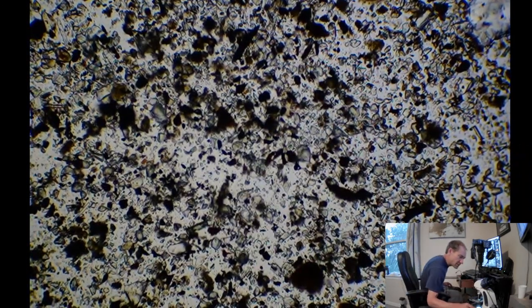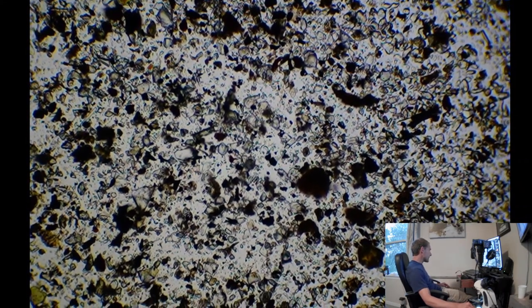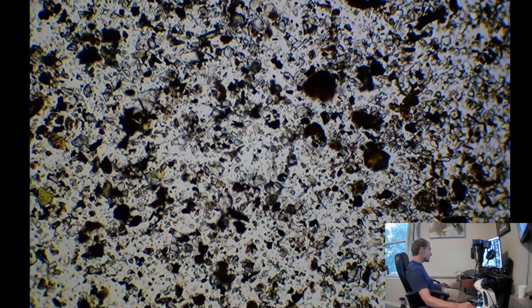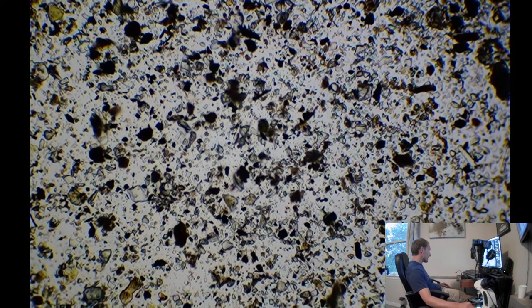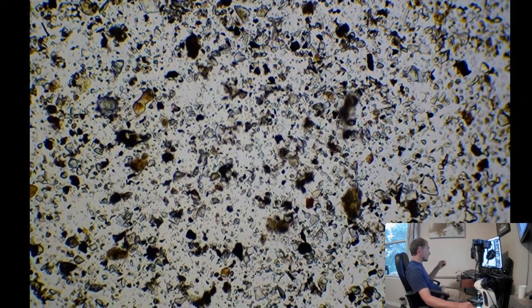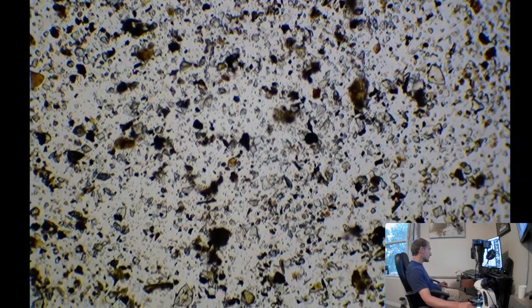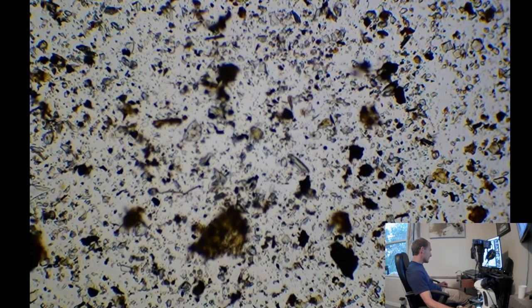Well, we did a pretty good job spreading this slide out, but not the best. Could use some work on that. Everything all equally dispersed. It's hard when you put a drop in the middle, then you gotta space it out throughout the whole square slide without really disturbing it too much.